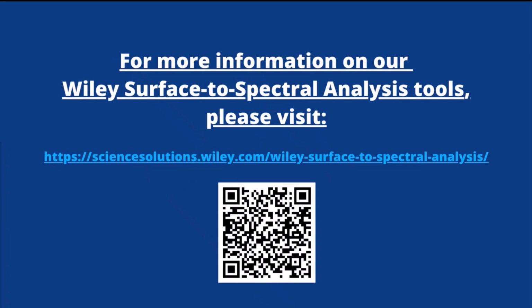Here's one. Would this software be suitable for a school in conjunction with KnowItAll campus-wide solutions? Great question. Yes, it would be. And I do think it would be an excellent addition to maybe a core microscopy facility on campus that has campus-wide solutions. It would also be a great way of leveraging the investment in the high-end microscopy equipment at the core facility. And a lot of times the microscopy equipment has like older, outdated, buggy software. So this would, I think, be a big improvement.